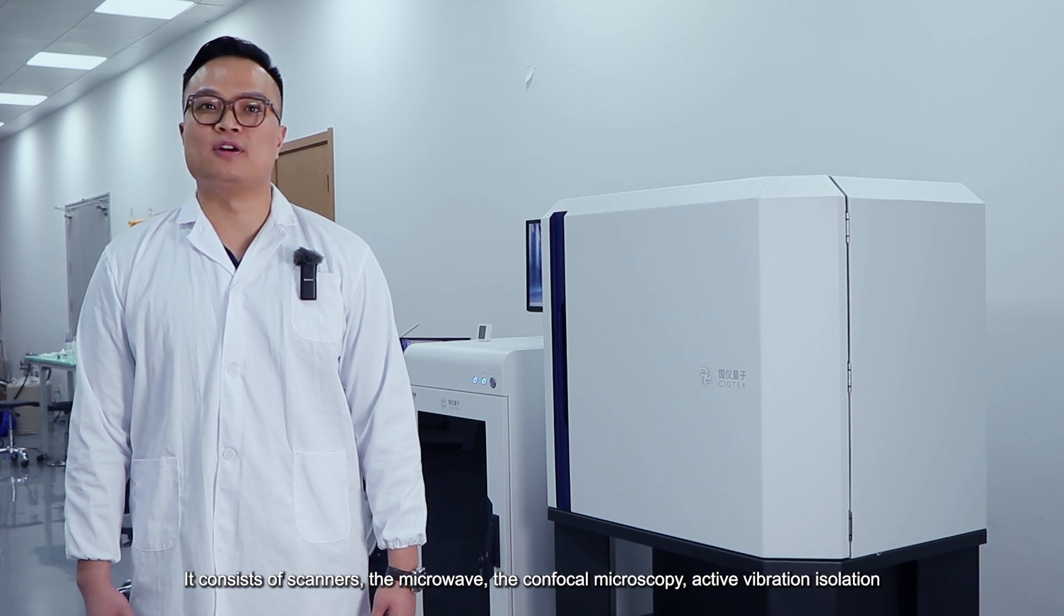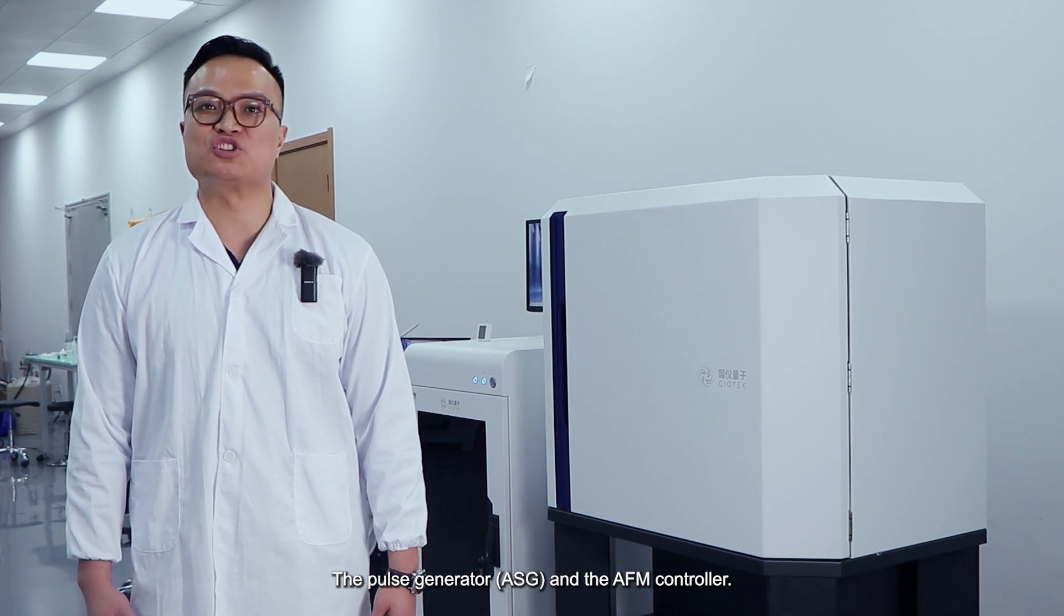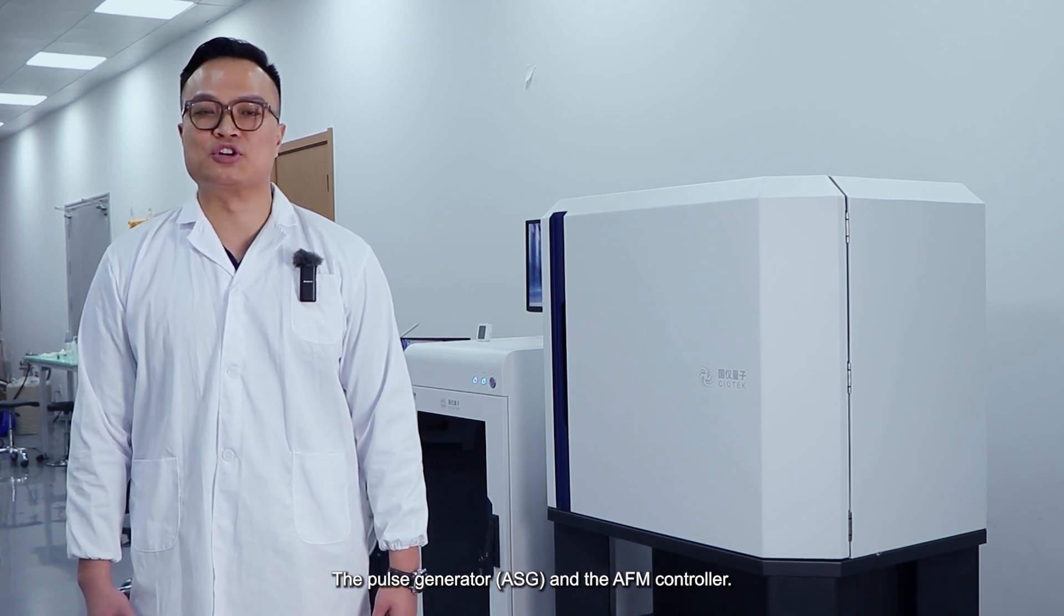It consists of scanners, the microwave, the confocal microscopy, active vibration isolation, the pulse generator, and the AFM controller.